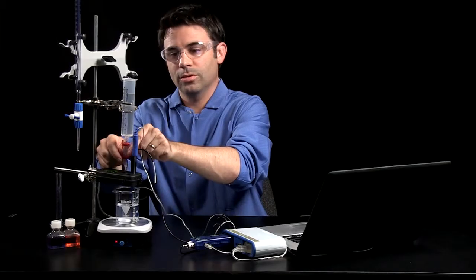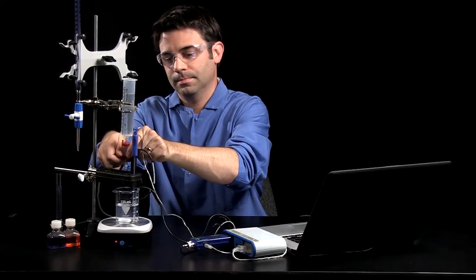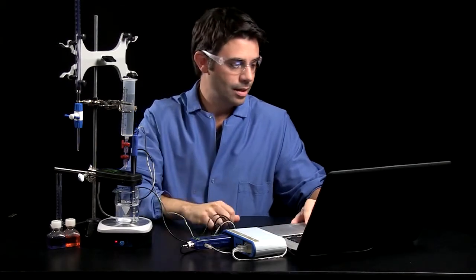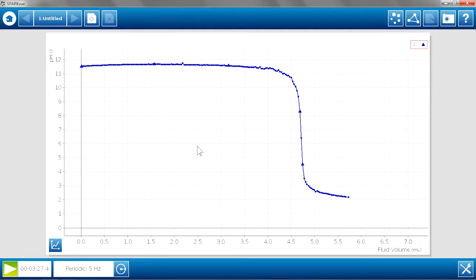Okay, I'm going to turn off the drop dispenser. And I'll stop data collection. Now we have a textbook example of a pH titration curve of a strong base with a strong acid.